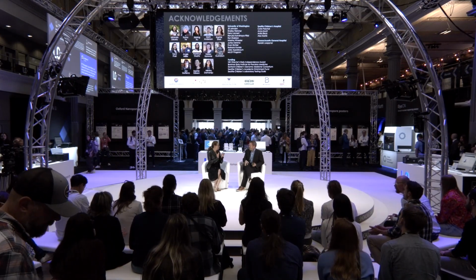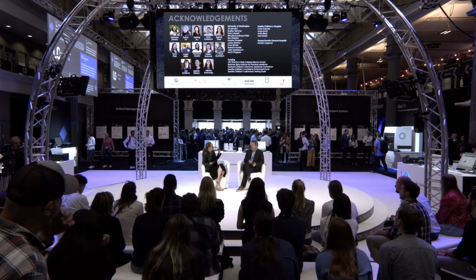You've been using both adaptive sampling and whole genome. Is there any particular application or reason that you pick one over the other? Because that's something that we get quite a lot. I can talk about a reason that we might use adaptive sampling today.